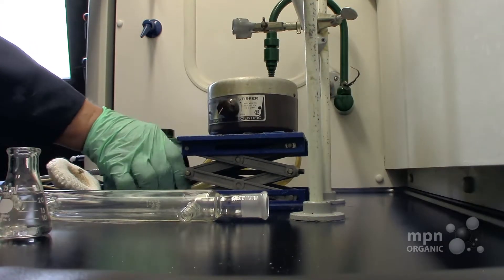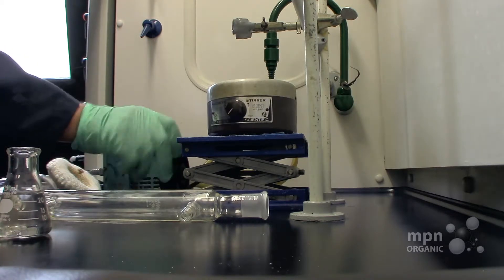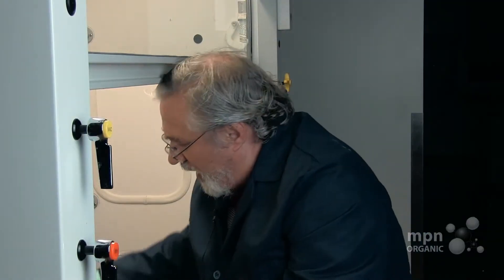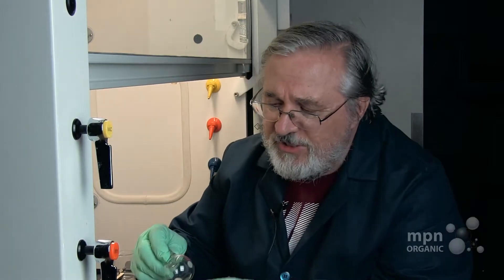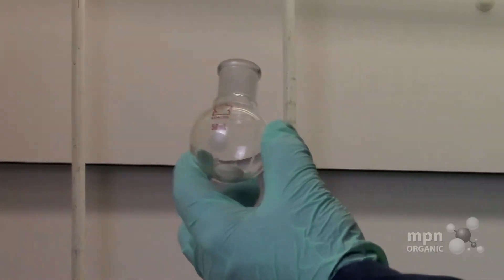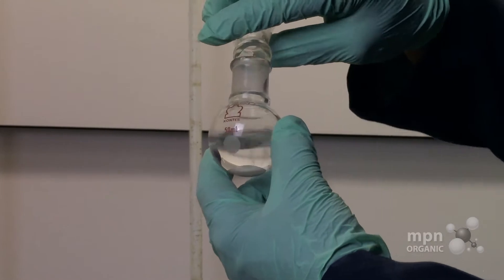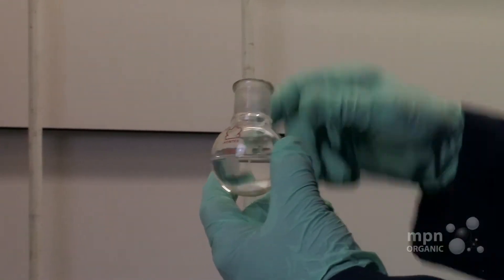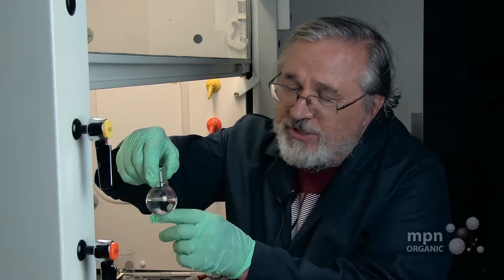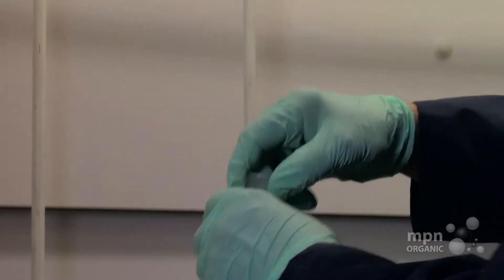Our lab jack can move up and down like this, and on top of it we're going to put a stirring motor. The round bottom flask says 50 milliliters up to the neck, so we don't want to fill more than about halfway. I've poured in 25 milliliters of acetone, so we're about half full.